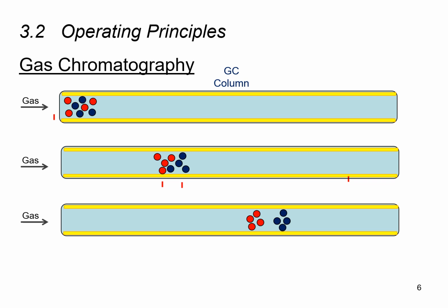So of course the inverse is also true. The blue molecules do not like to interact with the stationary phase so much, so that's why they are flowing quite quickly along through the column. So in the third picture, we actually see that quite a lot clearer. So the red molecules are clearly already separated from the blue molecules, right?